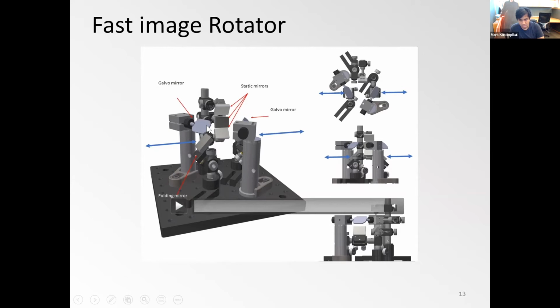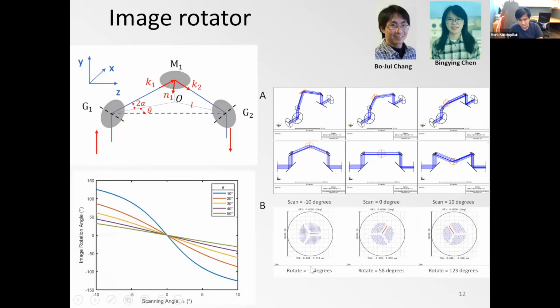But here, these are like 50 millimeter wide Y mirrors of the Cambridge ones. And you may also note that they have to scan between plus and minus 10 degree mechanical angle. So that's their full angular range. So it's not a small step response, it's a big angle response, but you can still flip them with about 2 milliseconds between those states.